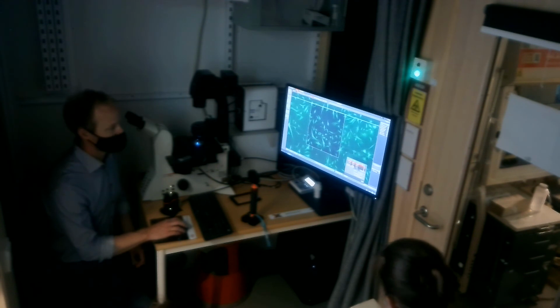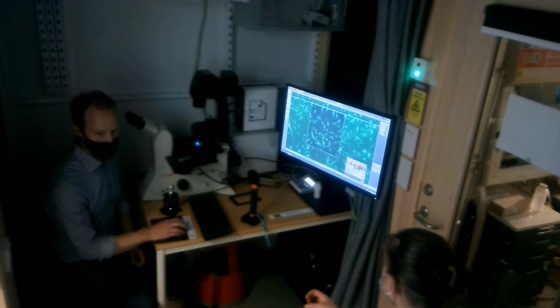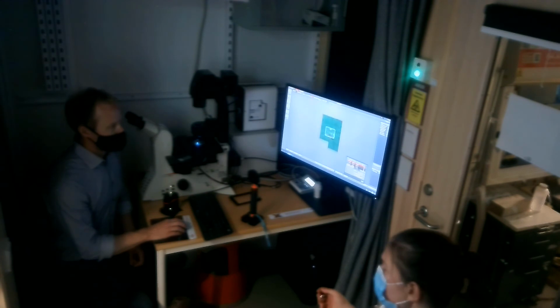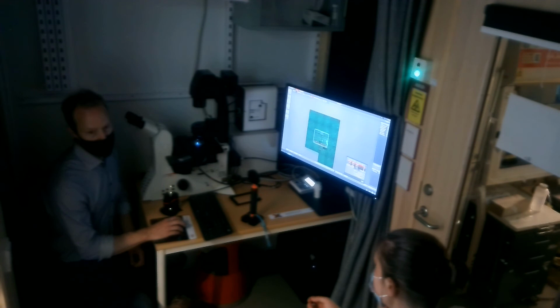focus points. But the focus map, it's working only in a range, right? So if I choose only 2 fields of view, then... No, so now when I put the focus map with these 3 points, anything else, even for this whole travel range, it will interpolate.